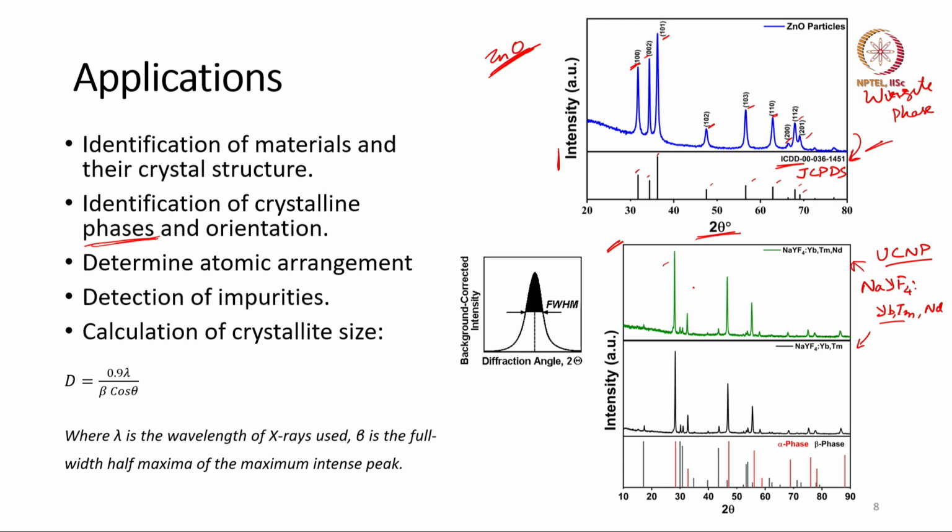You get a lot of peaks in both samples, and from all the characterization techniques you could say your material has been successfully synthesized.